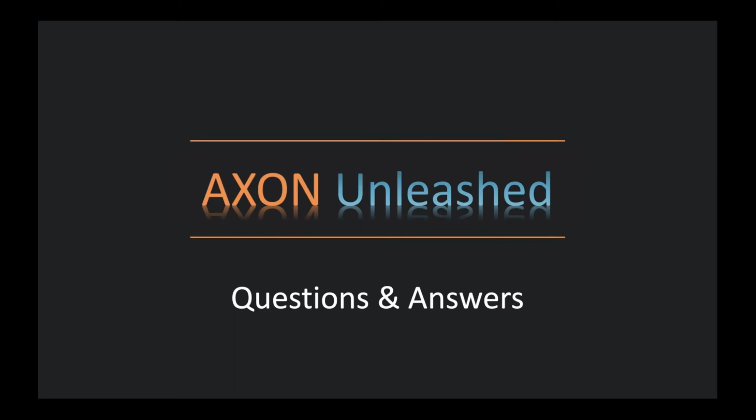Okay, and our next question, David, I think ties directly into that. Does AXON have any parameters that allow tuning or adjustments to the way that it controls the drift, or do you just turn it on?